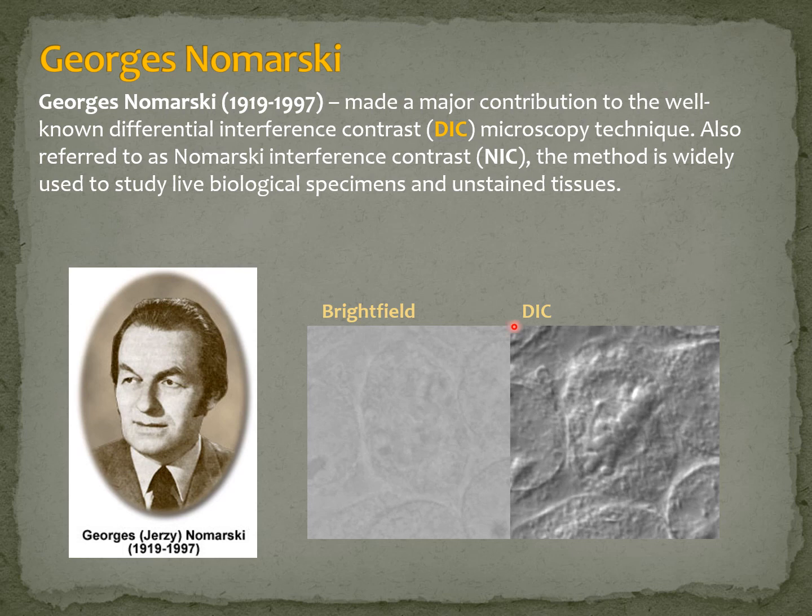And as you can see, to visualize what's happening is a transparent sample that otherwise has no contrast, like in here in the bright field. With the DIC, or differential interference contrast, we can enhance the contrast of a sample that is otherwise not colored, with no contrast added to it.